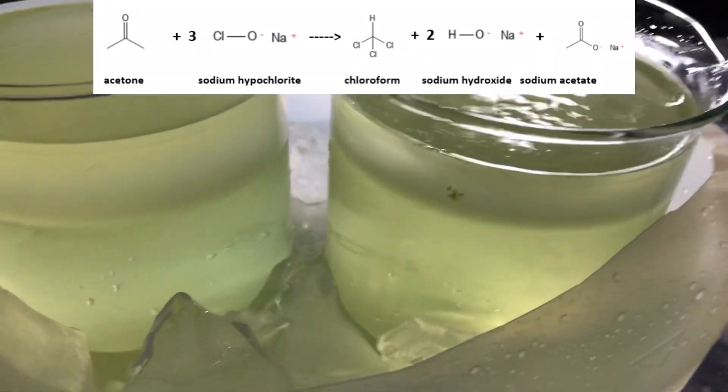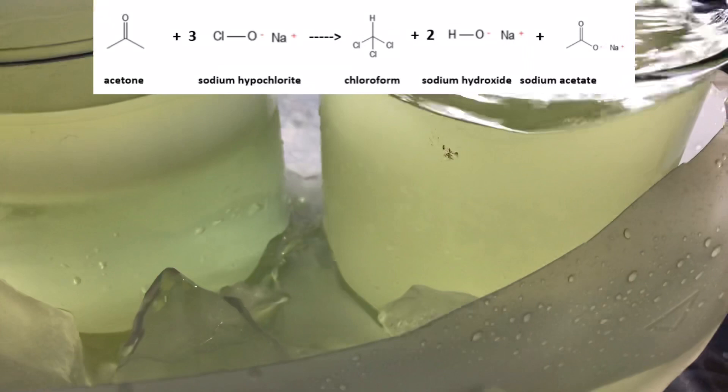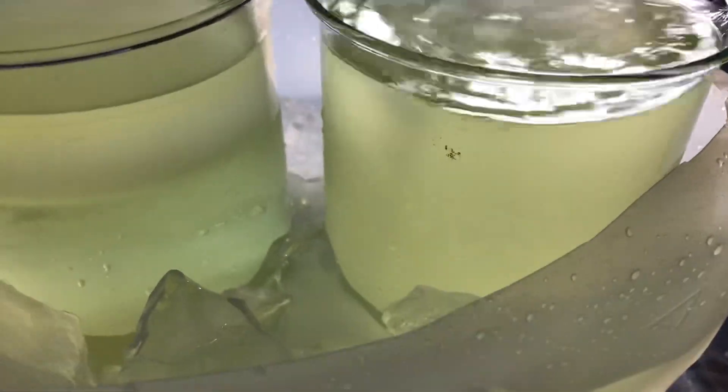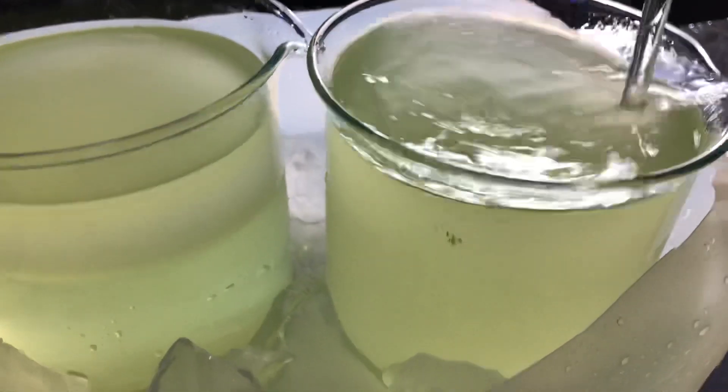If the reaction mixture gets too hot, the sodium hypochlorite will break down to form sodium chlorate and sodium chloride, and therefore the sodium hypochlorite concentration will decrease.